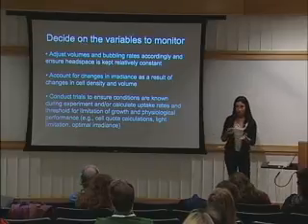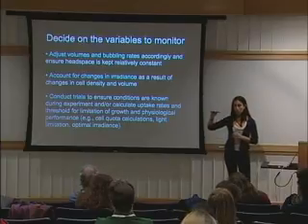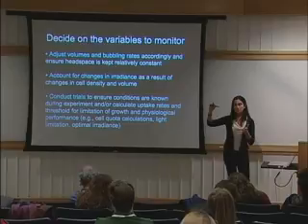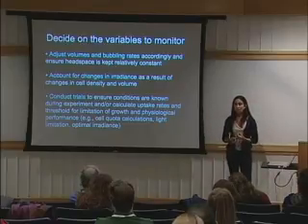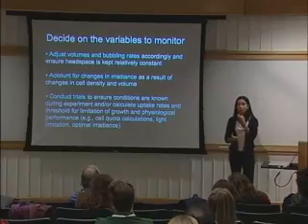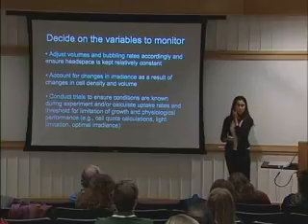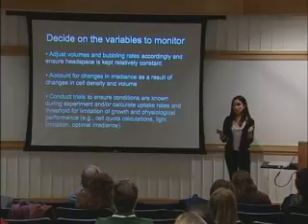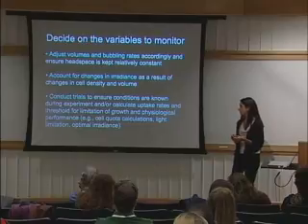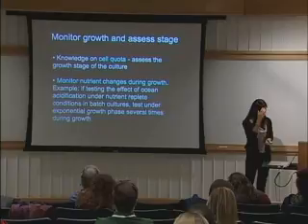If you run your experiment and you have your conditions, with your cells exponentially growing, you can measure your particulate organic carbon and particulate organic nitrogen, and that will give you your cellular quota. Then you can estimate at least the maximum cell density that you can have in your culture for it not to experience nutrient limitation, for example. And these are things that we don't tend to do unless we think about it.